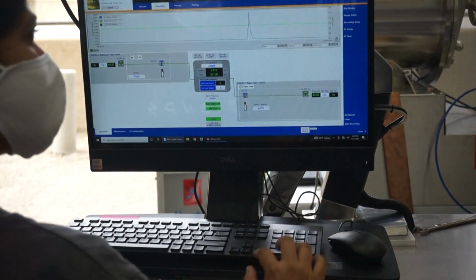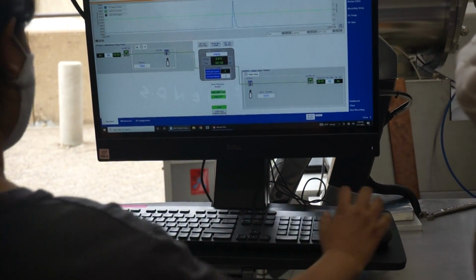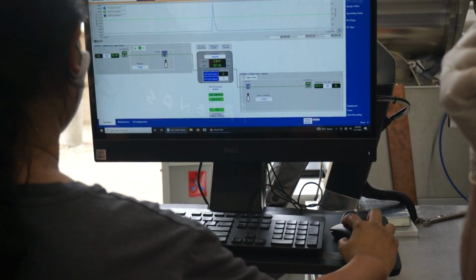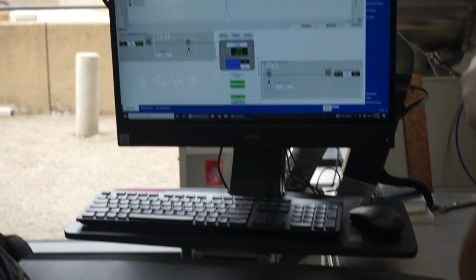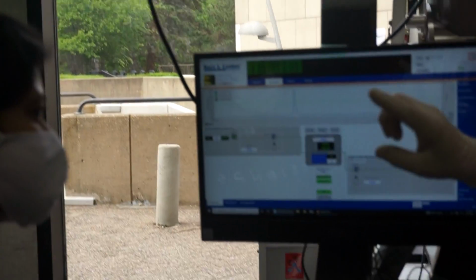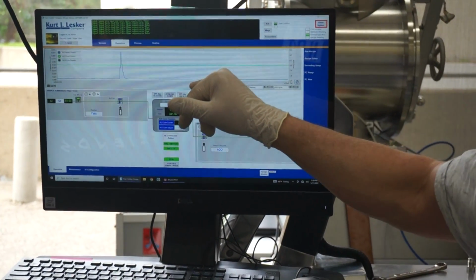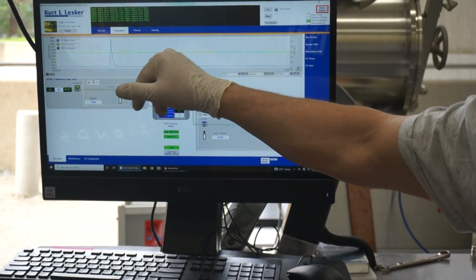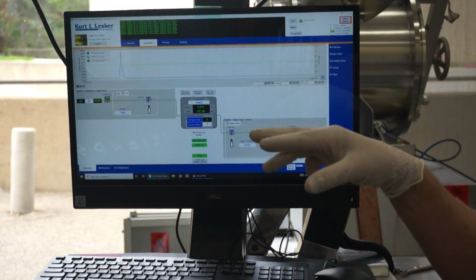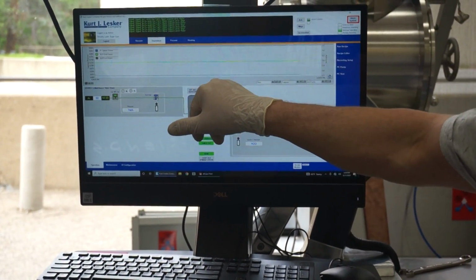You don't necessarily need to wait any certain duration, do you? Half a second. And do it one more time. And close it. Now, one of the things, this is normal, what you would expect to see with a good seal. Doesn't mean it's leak tight. I mean, it's probably okay. If you have a gross leak, then the second and third time you did this, you'll see something. So that was half of the pump purge. Now, you want to do 0 all flows, off all valves.